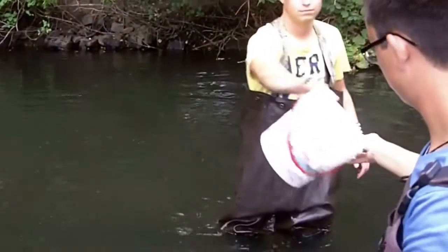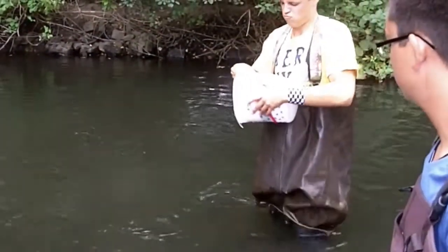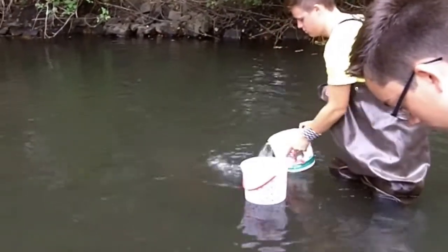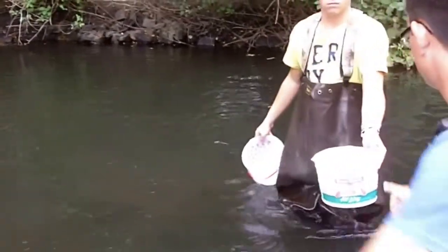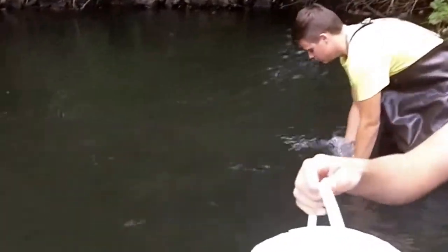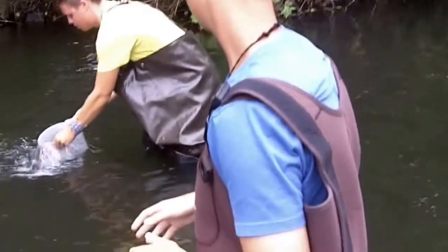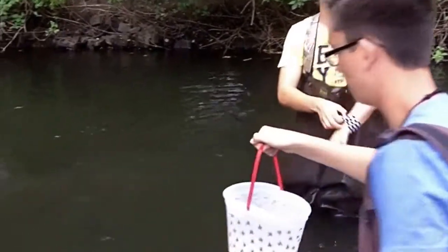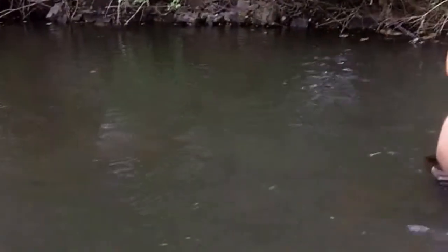You don't want water that's too deep either, because then we might be getting sediment from the bottom. So midstream, mid-depth — keeping your feet still. Just like that.